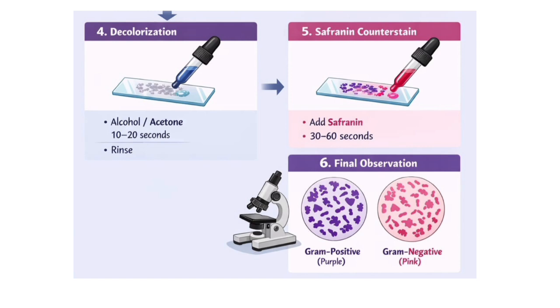The gram-positive bacteria, having thick peptidoglycan, will remain violet in color due to having the crystal violet iodine complex. But in gram-negative bacteria, having a lipid outer membrane, it will be dissolved and the crystal violet complex will be washed away and it becomes colorless. While performing the decolorization process, one thing should be remembered: over or under decolorization can give false results.